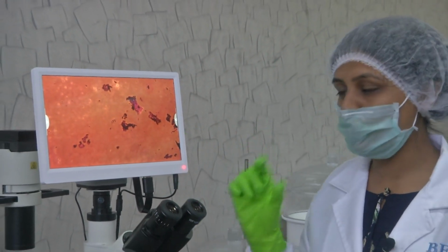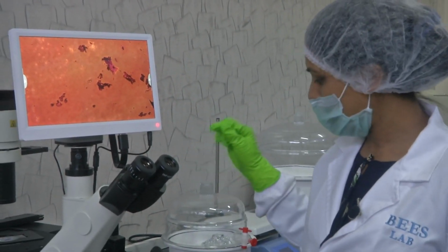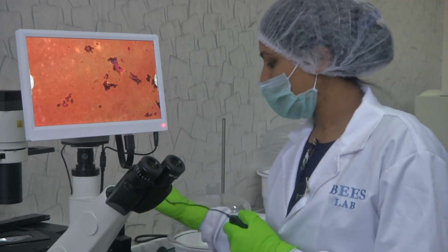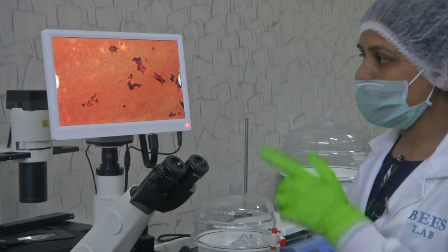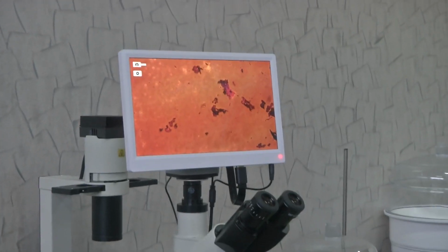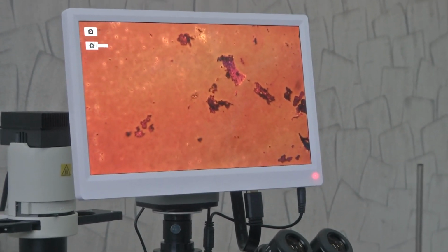You could also use your tissue culture petri dish. The live culturing can be seen using the inverted microscope. So there are multiple options provided here. The display allows us to live record features or even capture images which are seen. This image capturing feature is also there in the stereo and the metallurgical microscope which I had shown. If I click on this, the image is captured, and you can use it for future reference.